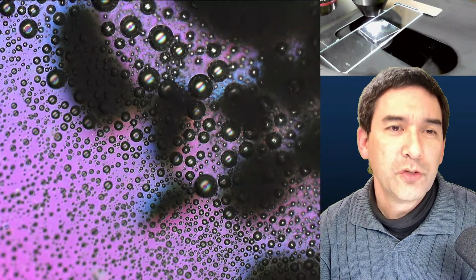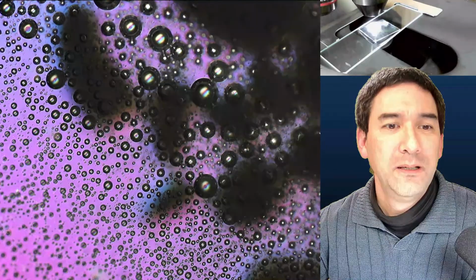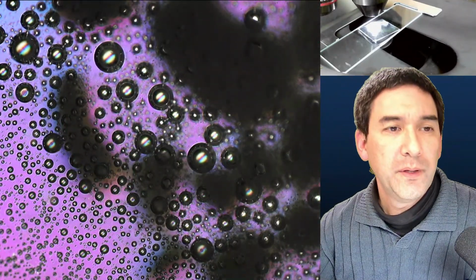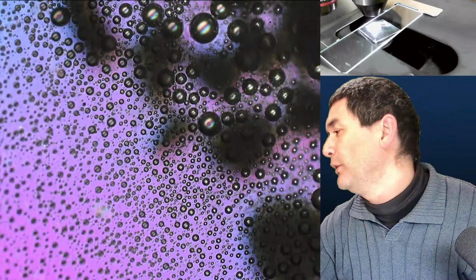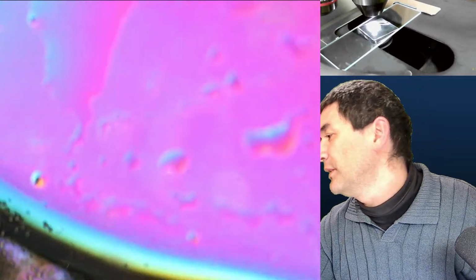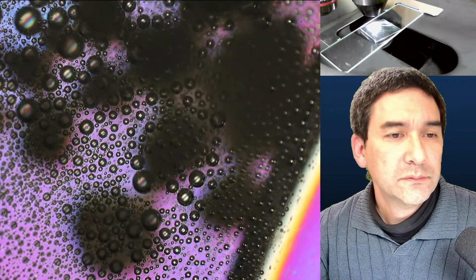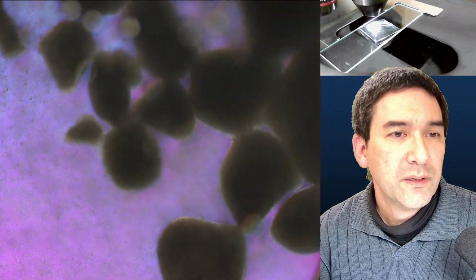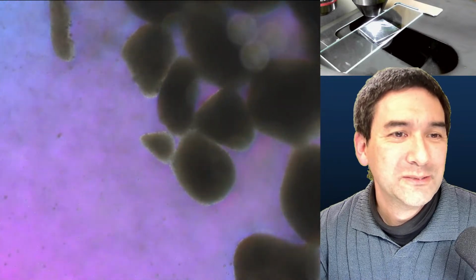Yeah. And even those bubbles look kind of nice. And then what you have to do is you have to wait somehow until this dries again, and then you basically are able to see hopefully some recrystallization happening. Almost all of it is already gone. Here it is. Here's some more. Yeah, you see actually how it becomes smaller and smaller.